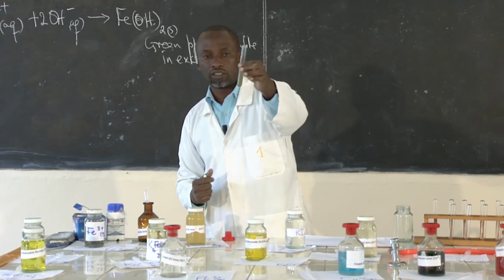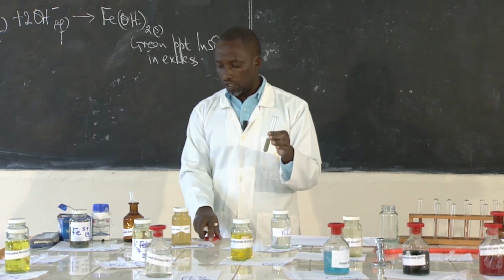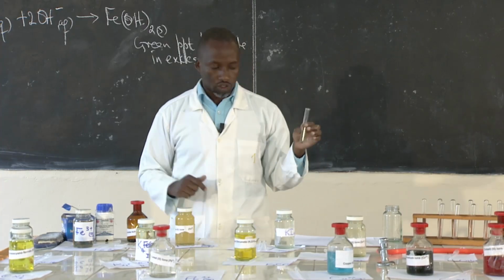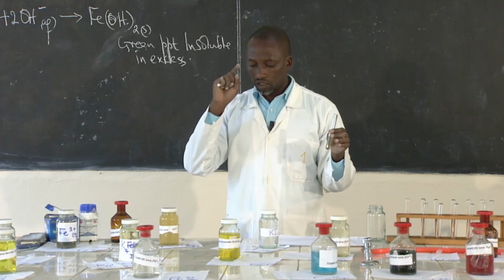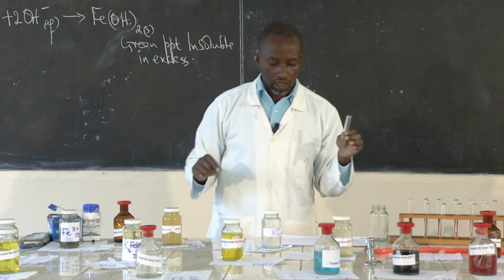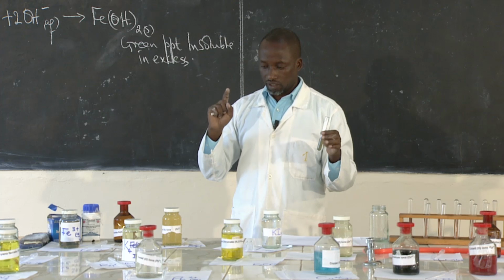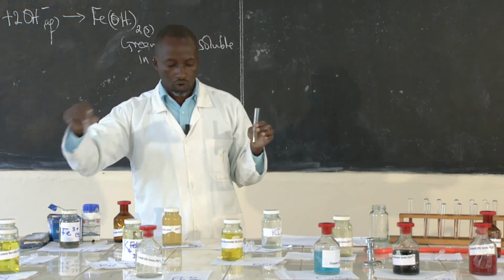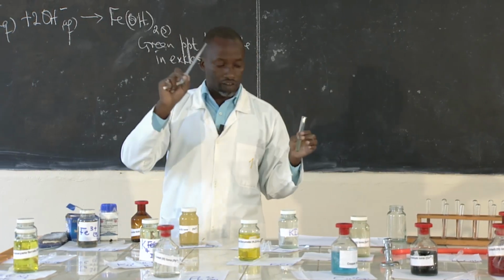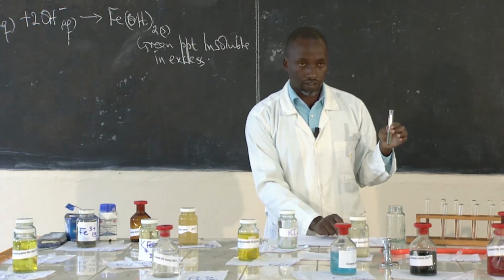So that's what happens. We are just going to look at the same solution and see the effect with ammonia solution. Please take note, we have different droppers here. Whenever you are carrying out an experiment, there are guidelines you need to remember always. Don't interchange these droppers, because you'll get wrong results. So be careful whenever you are carrying out what we call qualitative analysis.